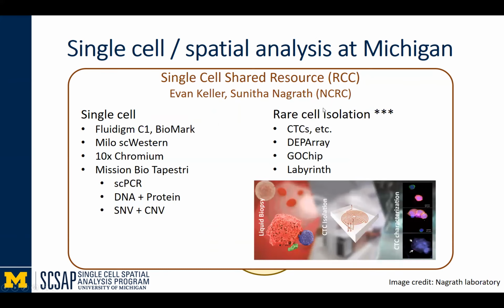So moving on to the single cell shared resource in the Rogel Cancer Center, which Evan himself and Sunitha, who are part of our program leads, are the head of this core facility. And they've over years developed many sophisticated ways of doing single cell analyses.